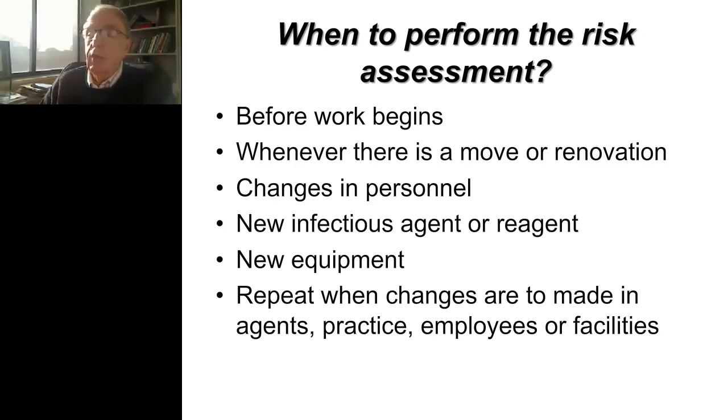Whenever there's a move or renovation, it's good to do the risk assessment. If you have significant changes in personnel, turnover of staff, then redo your risk assessment. If there's an emerging infectious agent that your lab is now going to be receiving specimens for, then doing a risk assessment is the appropriate first step in addressing that emerging agent.